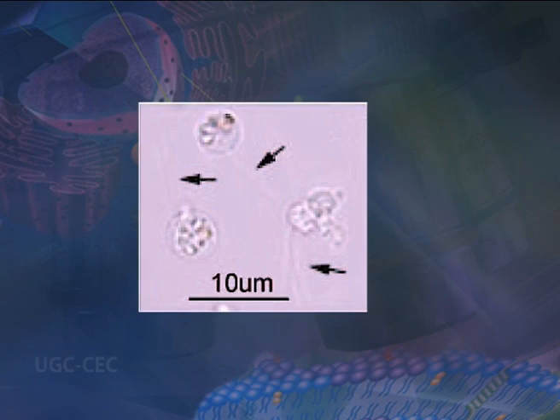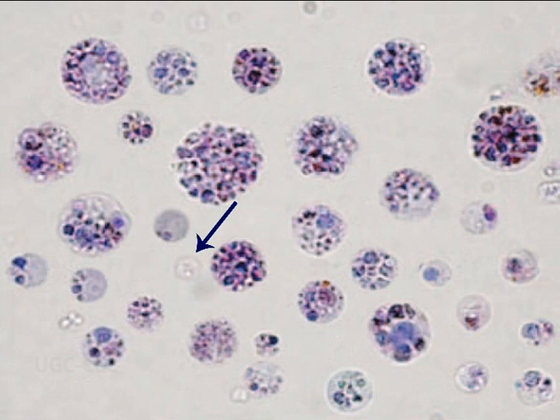According to granule amount and distribution and to the presence of flagella, isolated cells can be divided into 5 different types: cells with flagella, cells without granules, cells with very small granules, cells with a few granules, and cells with many granules.